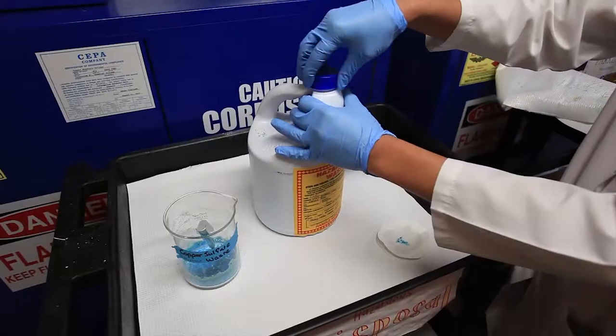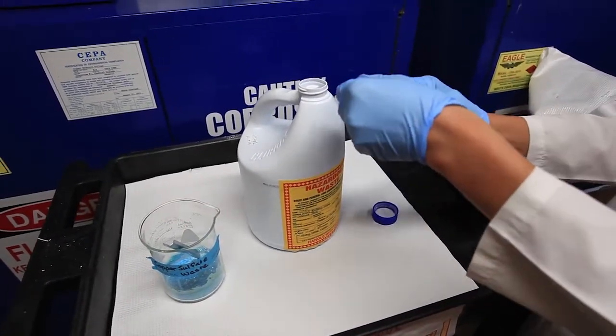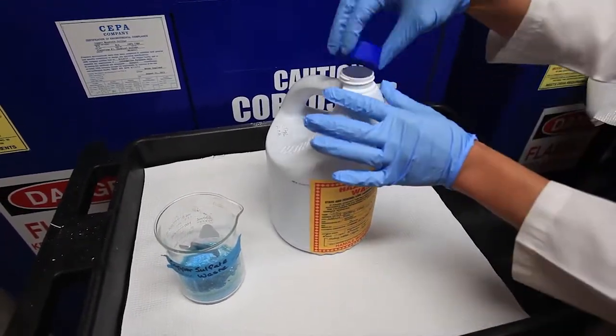Compatibility and reactivity are not the only things to consider when disposing waste. Some waste may be compatible but are treated differently when off-site. Also, some items such as filter paper that have been used in conjunction with chemicals have to be disposed of in a certain way as well. As mentioned earlier, always check with your professor before you dispose of any liquid or solid waste.